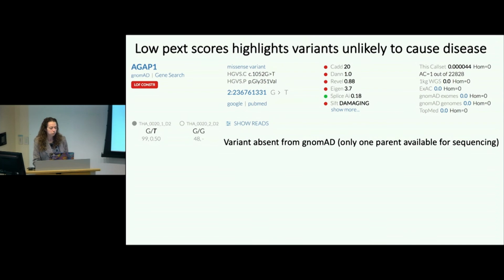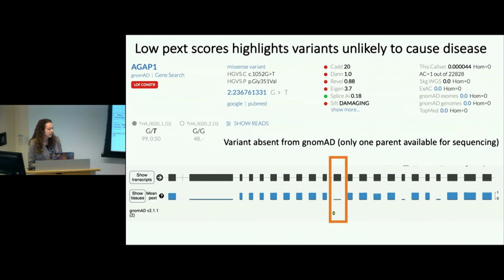This was a candidate for a while, but then someone went and looked it up in gnomAD, and this variant actually falls in this exon here that is not really expressed in most of the transcripts, and so that really lowered our interest in this. I can't say for sure, there are some caveats, but it made it a much less interesting candidate for us.